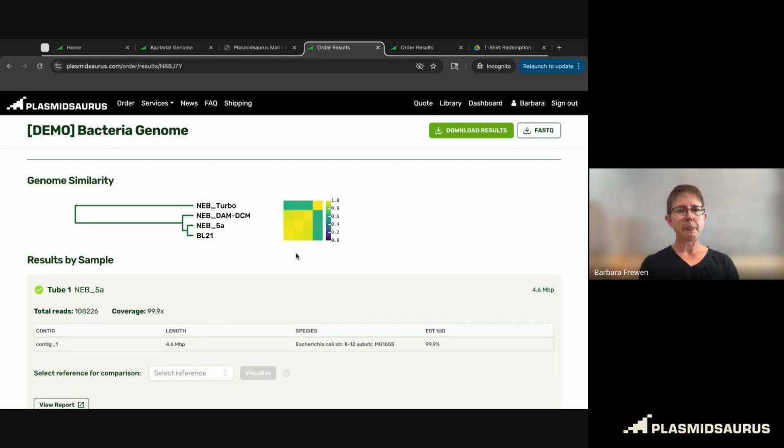So just a little bit about how to interpret this heat map. The color indicates how similar 2 sequences are. So the light here is 1, they're identical, and the very dark at the bottom is they're completely different. And so each row corresponds to each of these samples. And then as you think about the columns, if you kind of mentally rotate that set of sample names, you'll get the pairwise comparisons. And the way I remember it is this diagonal here is 1.